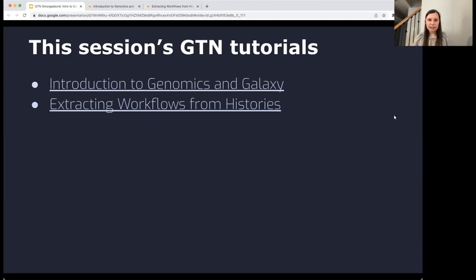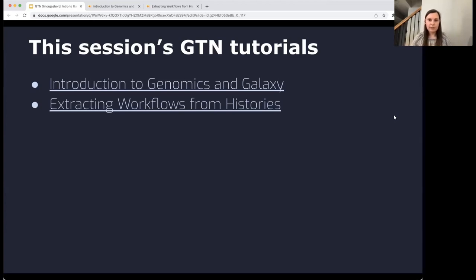In this session, I'm going to walk through two tutorials. The first is an introduction to genomics in Galaxy, and then we're going to use the extracting workflows from histories tutorial. As a preview, we're going to do an analysis where we bring in data, and then think about how we can run the same analysis again and again on other datasets without having to set everything up from scratch each time.